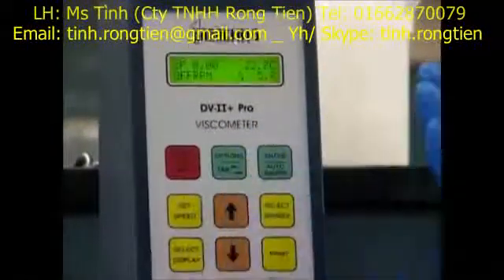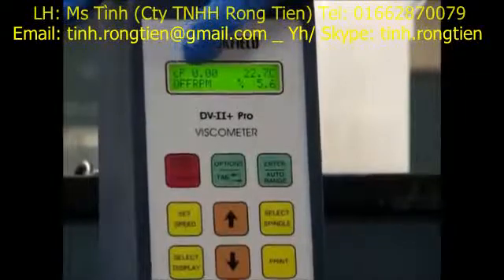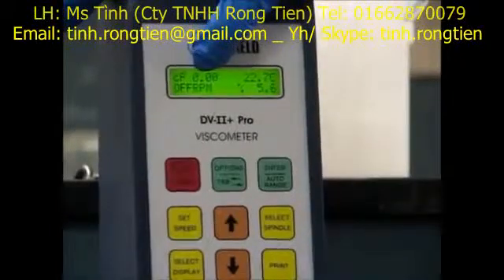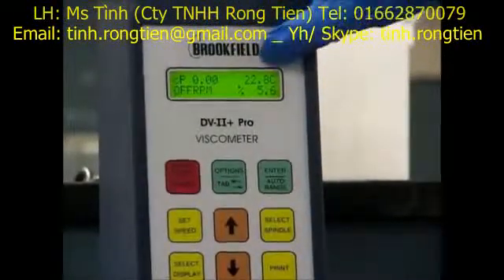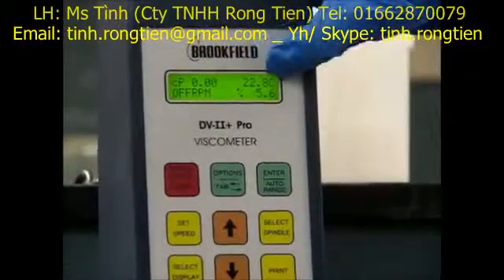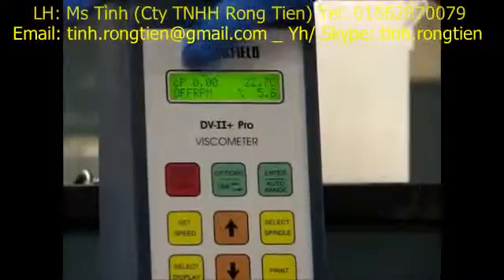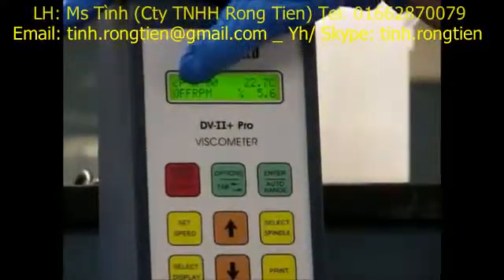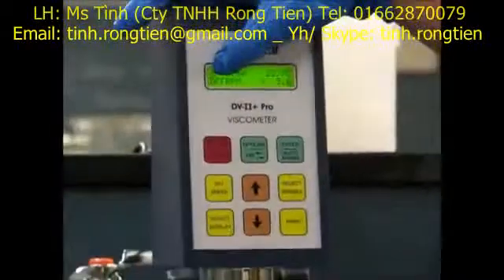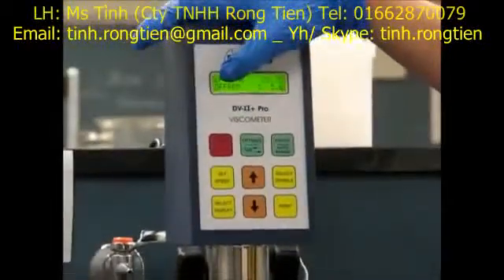There are four different things you can see on the display: the viscosity once it's turned on, the temperature of the fluid, the percent torque, and the RPMs. Right now it's off. We're going to be adjusting the RPMs to take our measurements, using the up and down arrows.